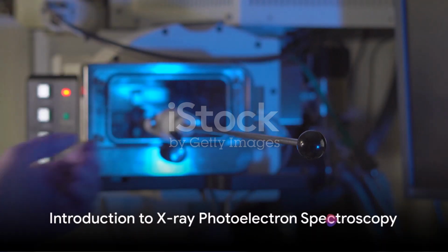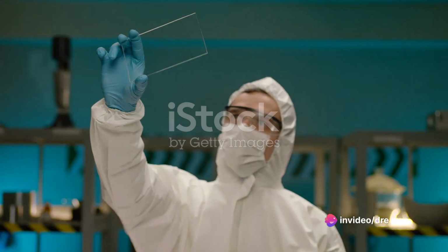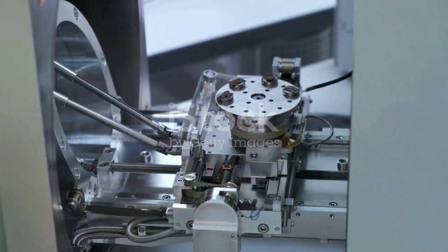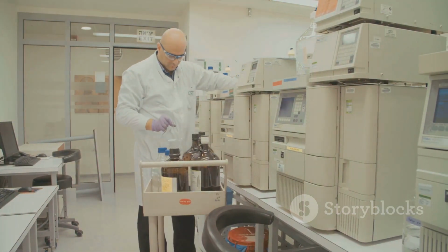Have you ever pondered the intricate details of the surface of solids? How do scientists manage to characterize these surfaces so accurately? A key player in this field is X-ray photoelectron spectroscopy, or XPS.